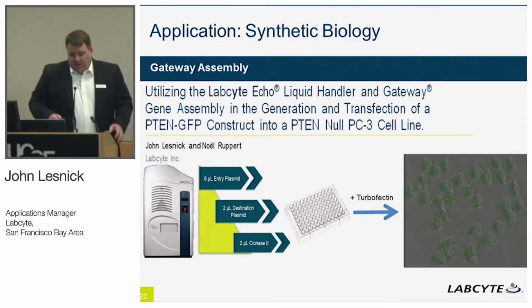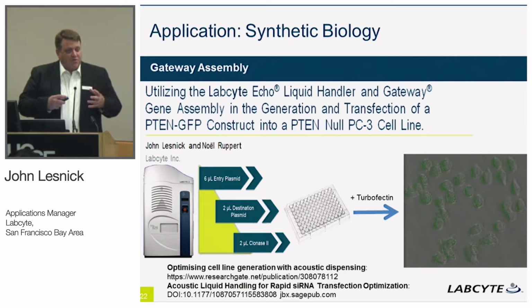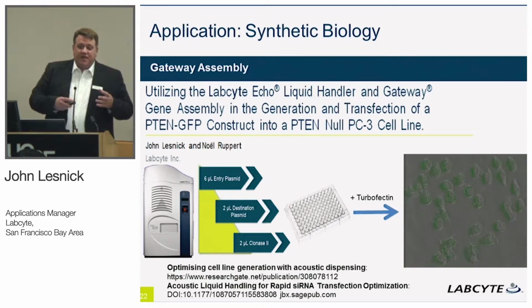One point to note, if you're doing many transfections, you know that transfection is not exactly an easy, straightforward method to do. You've got to worry about DNA concentration, the amount of lipid that you're going to use, sensitivity to the cells. So what I've done in the slide, and you're welcome to these, are a couple of references that highlight the ability of the Echo to run those matrices for you to determine the optimal transfection conditions to get a transfection efficiency within your particular cell line.